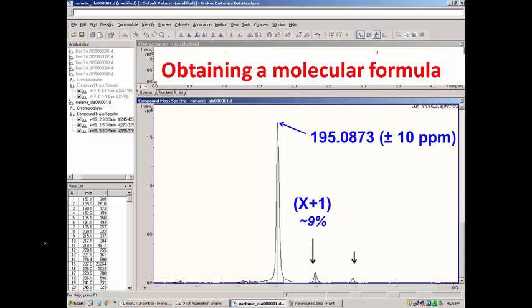We're also seeing these little isotopes here, and the intensity of those isotopes can be obtained. That might be of use to help confine what the possible structures are. But that's really what the exercise is: what is the molecular formula of this particular compound?